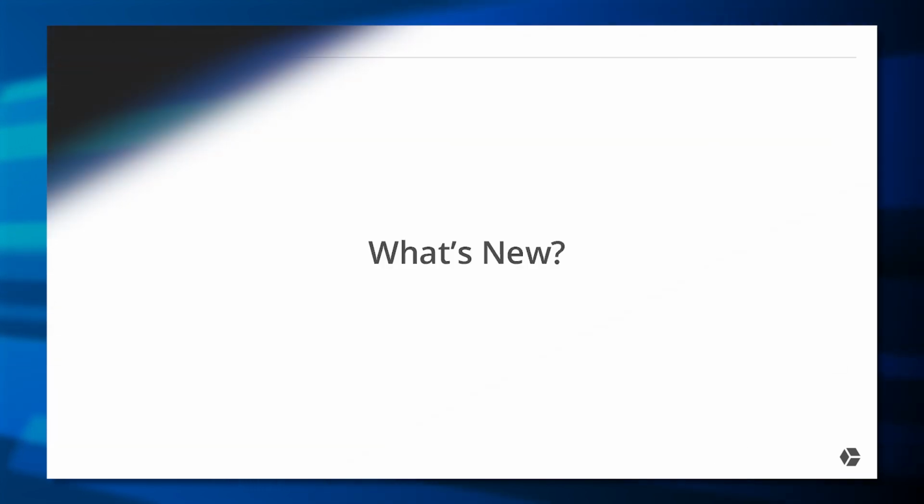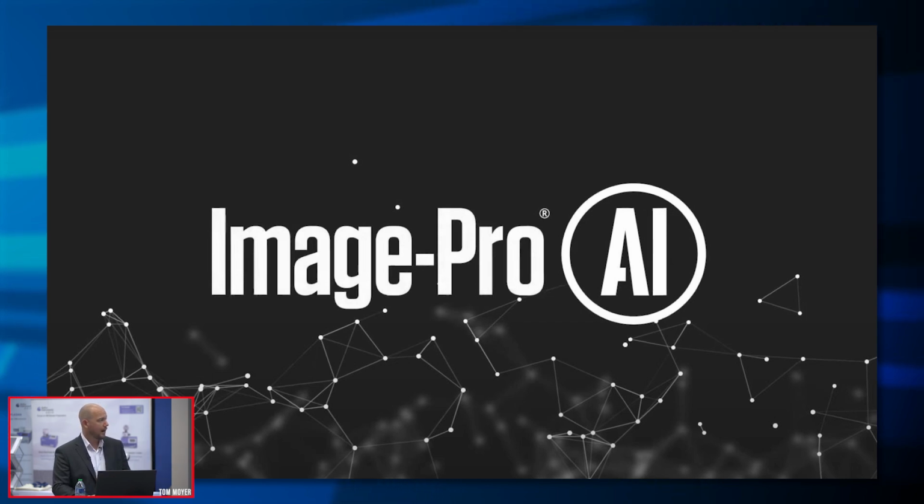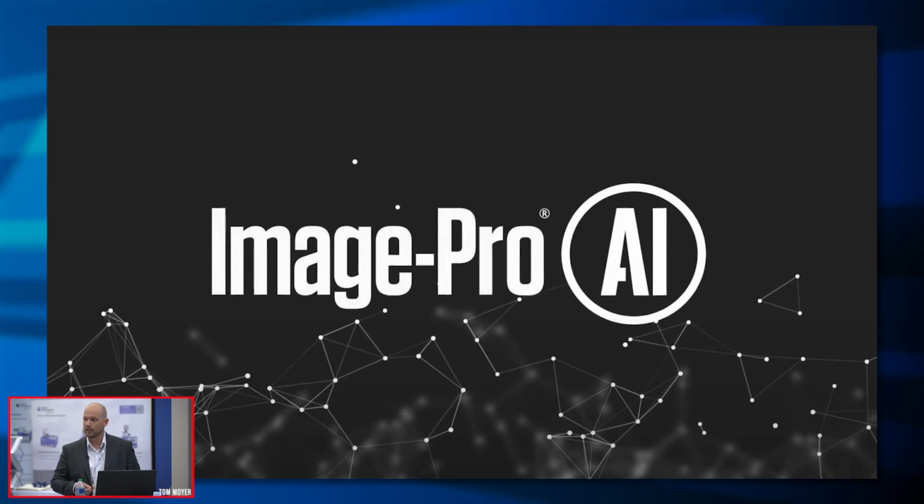So what's new? Well, I'm happy to announce our recent software launch, Image Pro AI. This latest version brings in AI deep learning segmentation for a higher accuracy, and also the ability to count objects and find areas that we previously could not find. With Image Pro AI, we've not only integrated AI deep learning technology for the segmentation, but also application-specific protocols that provide a guided workflow for different types of analysis.